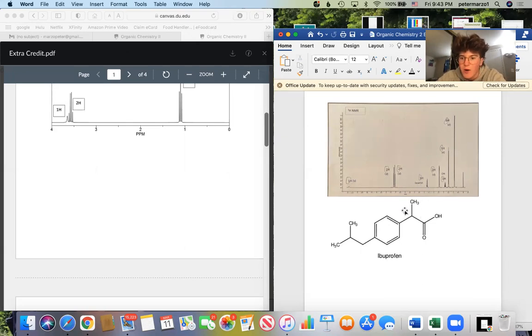When looking at ibuprofen, we can recognize all of these structures present in the proton NMR. First, the 1H, which is a part of the carboxylic acid, is present right here in this OH. Next, the 2 groups of 2 equivalent hydrogens are present on the aromatic group here and here and here and here. We can see this because the hydrogens attached to these 2 carbons experience the same properties as each other, and these 2 do as well. So there are 2 groups of 2 equivalent hydrogens on the aromatic.